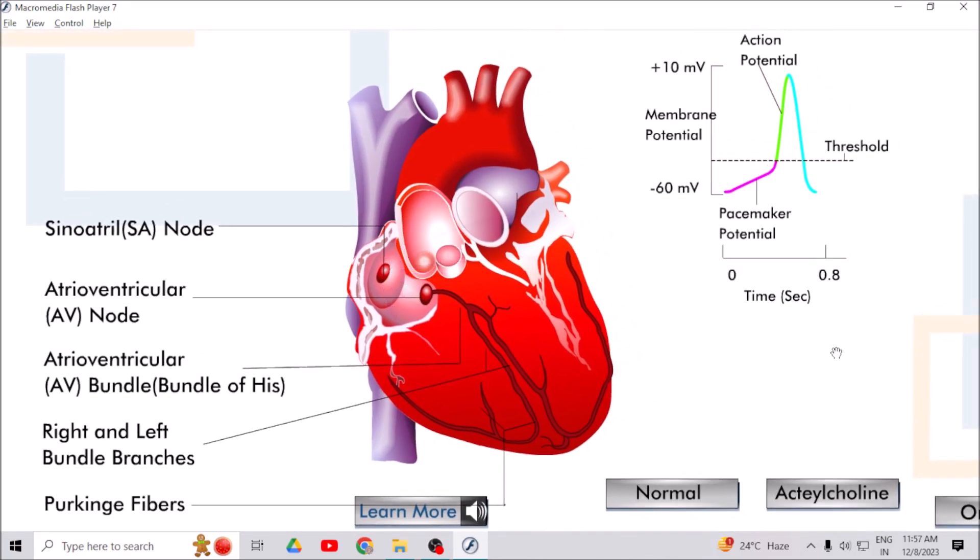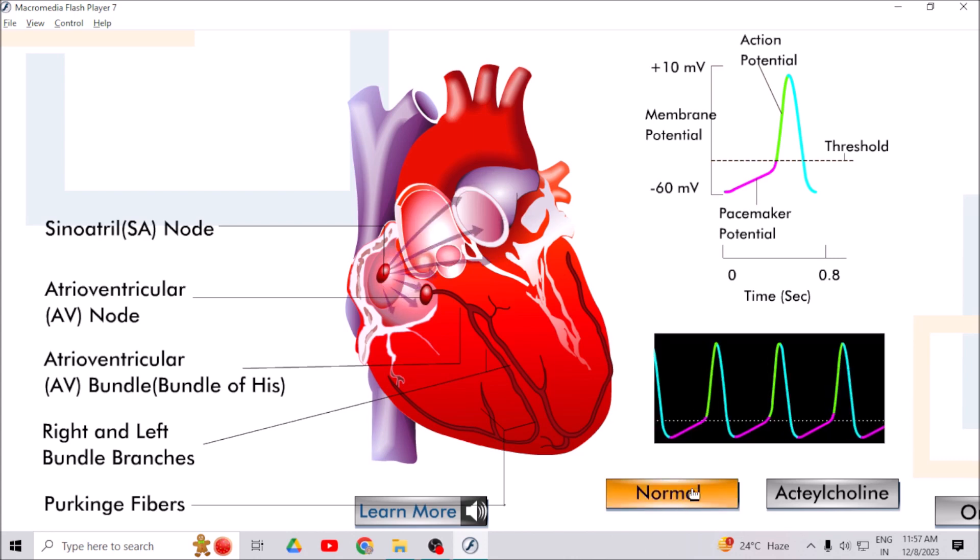Acetylcholine regulates the pacemaker of the heart which controls heart rate. Acetylcholine reduces the rate of depolarization and thereby reduces heart rate. You can see the gap between two action potential peaks is more in the presence of acetylcholine.